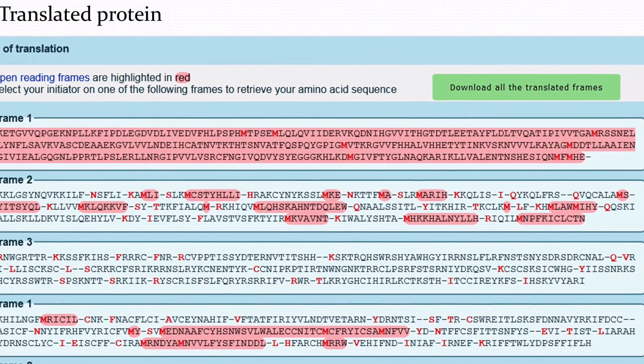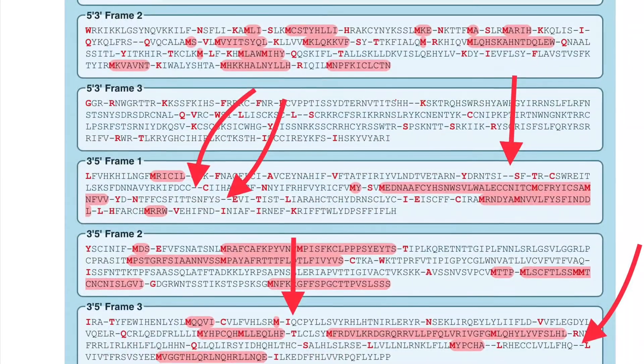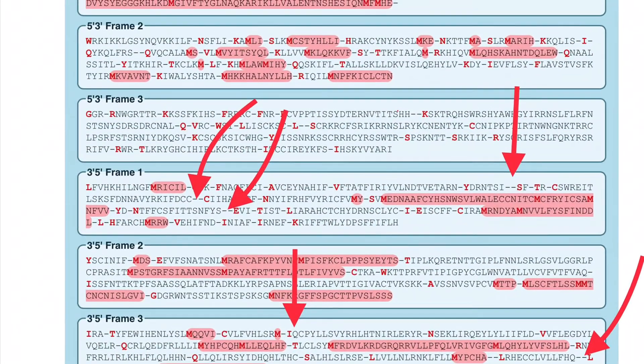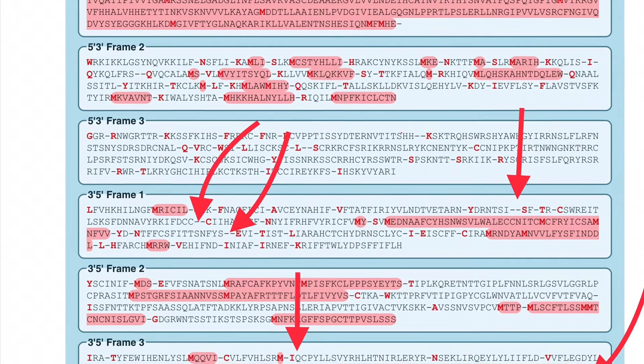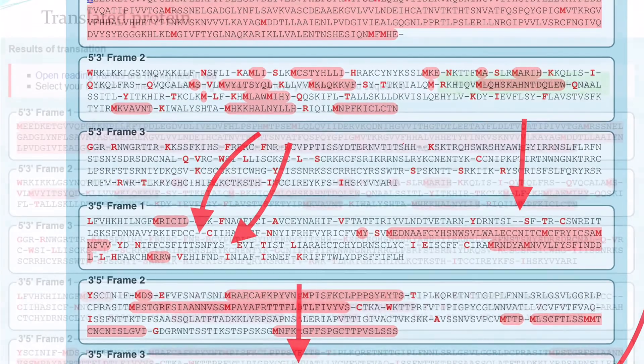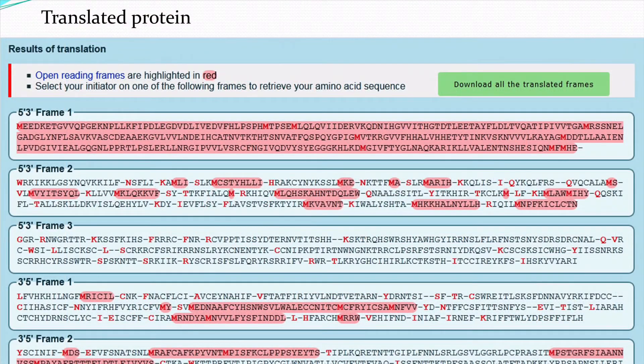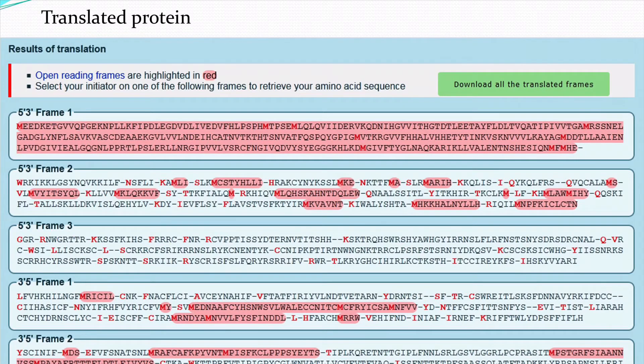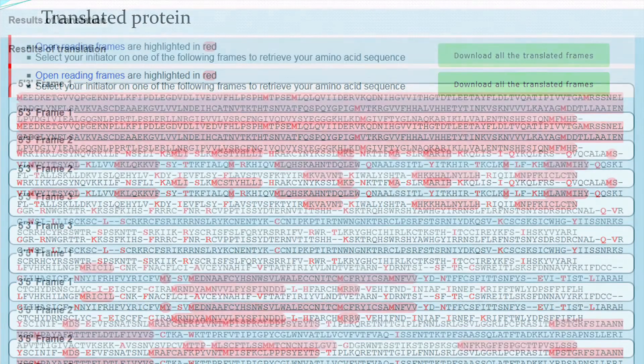In the other reading frames, in between you can see small hyphens. These hyphens indicate internal stop codons. That means those reading frames are not suitable for this nucleotide sequence that we have given as input.